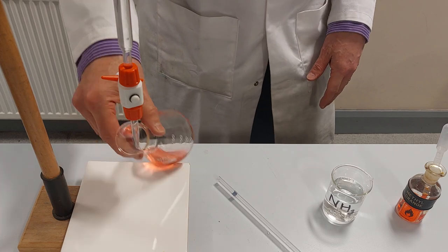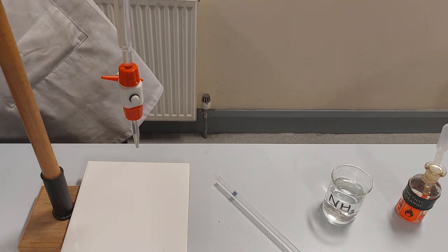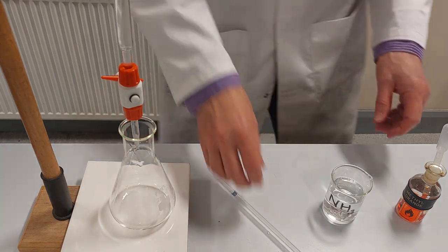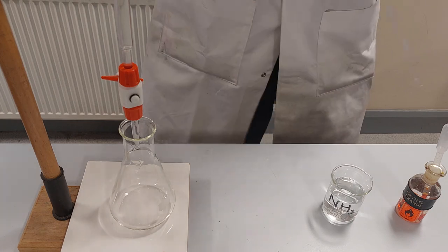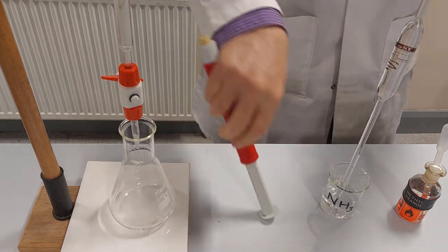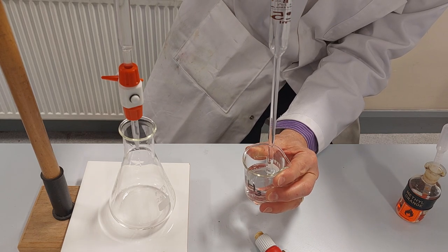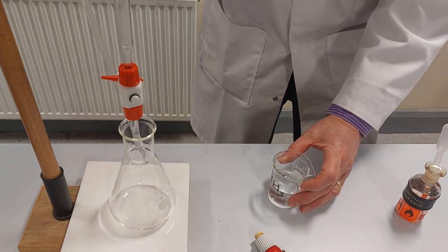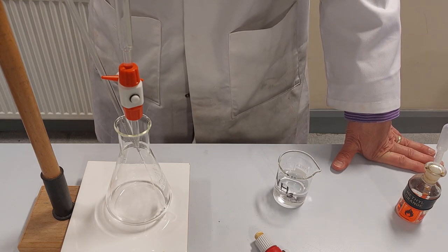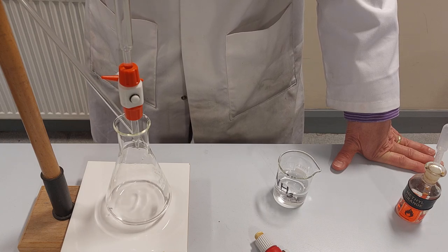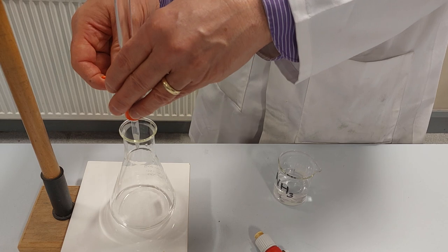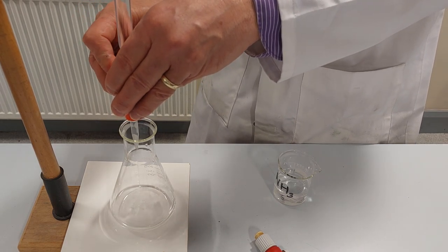Okay I'm just going to do it again. Give the flask a good rinse here and I'm going to measure another load of ammonia. But this time I'm not going to use any indicator and the reason for that is I want to get a pure sample of the mixture that's formed when the acid and the ammonia react.